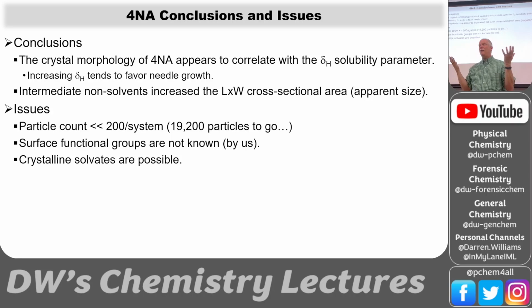So I did this by hand because I don't have the analysis system to characterize these things automatically. So of all of those little petri dishes, all I counted was 200 particles roughly for each of those petri dishes, which is not near enough. That's why the error bars on my analysis are absolutely huge. But I did sort of satisfy what I was after. Is there a different particle shape depending upon these precipitation paths? And the answer to that is absolutely there is.